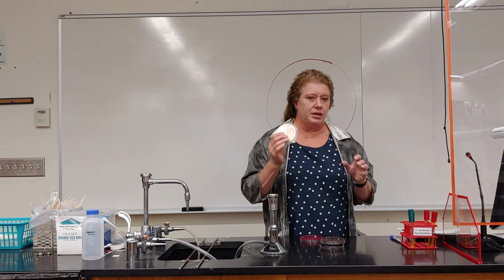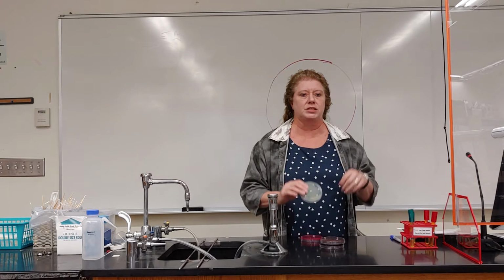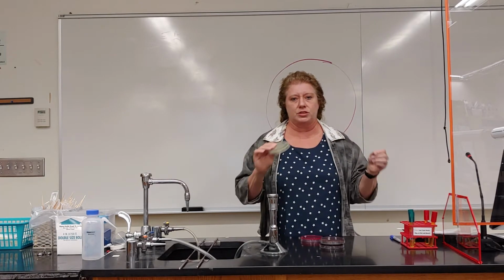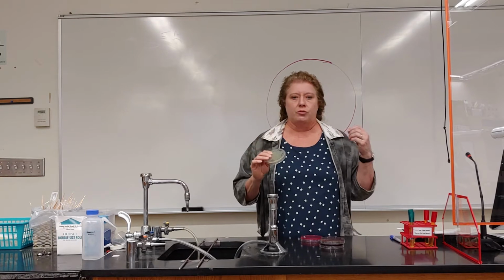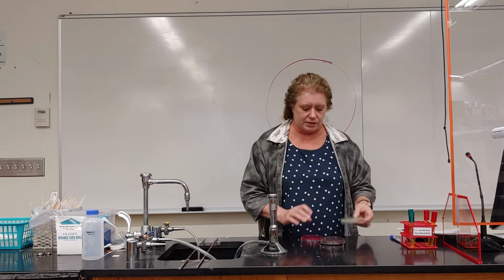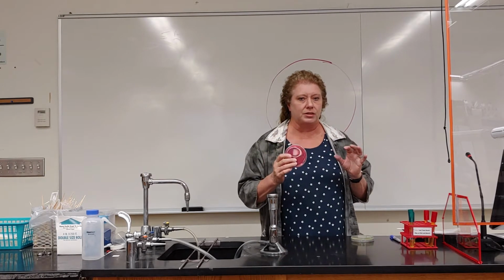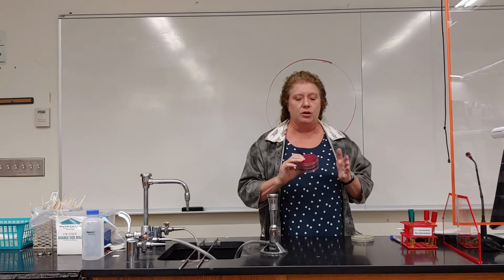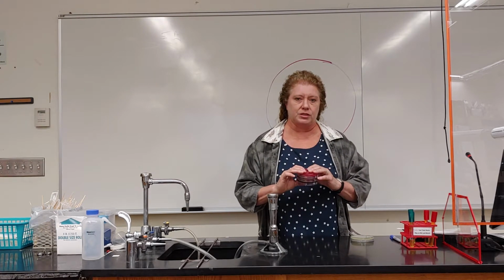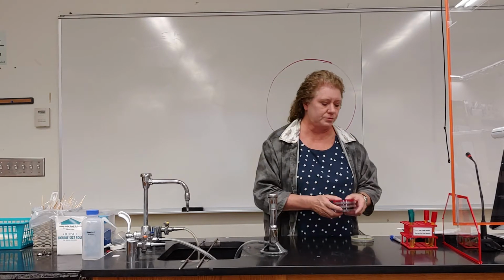So the PEA is a selective media only. Selective means it allows growth or it doesn't allow growth, so it's giving you a simple answer. For instance, it could be gram positive versus gram negative. That's what that is telling you. The differential ingredients in these 3 other media, which are selective and differential, will allow you to tell more information about each of the unknown bacteria if they grow, but only if they grow.